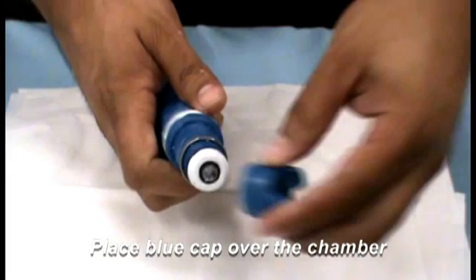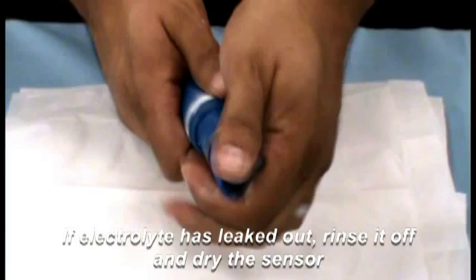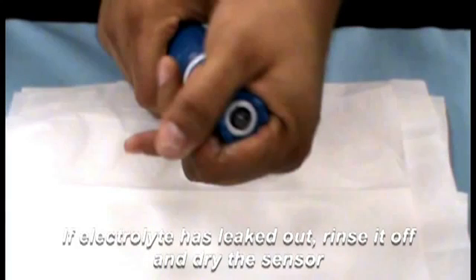Install the blue cap back onto the sensor, hand tightening only. Some electrolyte may leak out — simply rinse off and wipe up with a soft cloth or tissue.